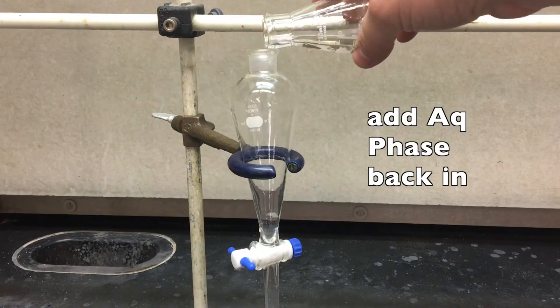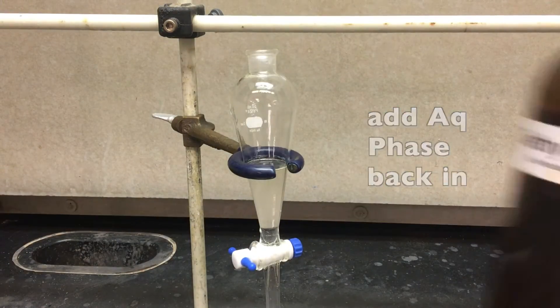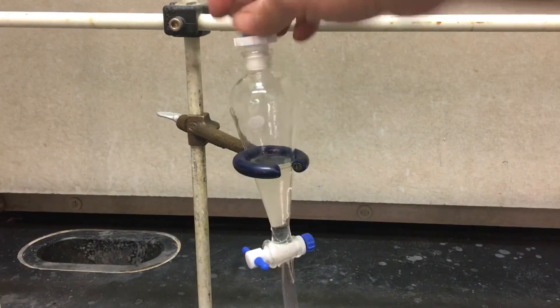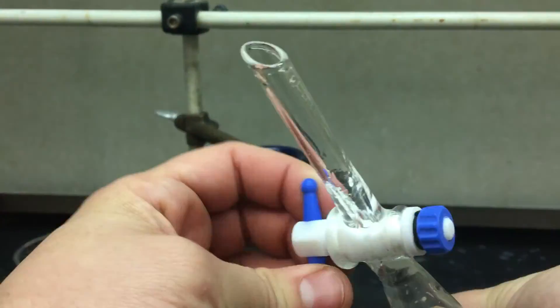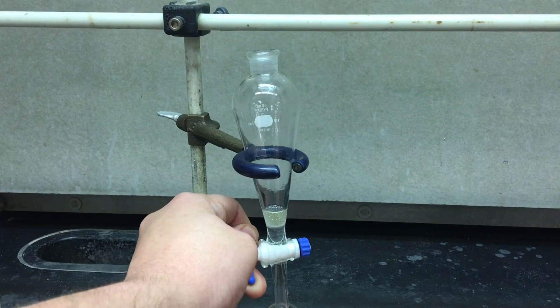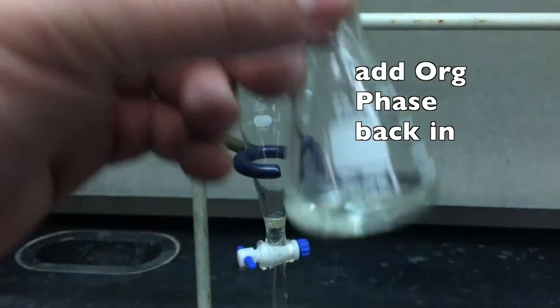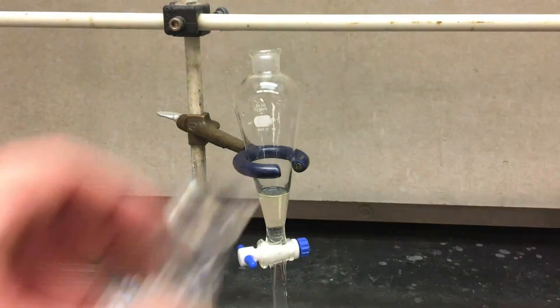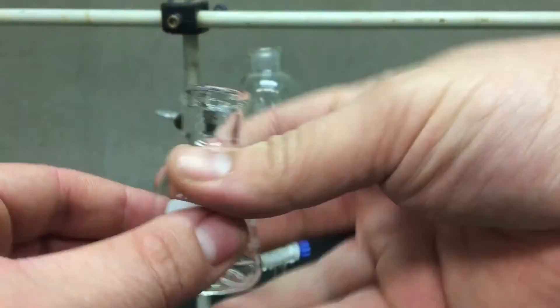Place the aqueous phase back in the separatory funnel and re-extract it with a bit more diethyl ether. Notice how I use the ether to clean out the aqueous phase container. Once again, cap, shake, exhaust, repeat, let it settle. Collect the aqueous phase again — we're done with that, that is trash. To the organic phase you have left in the separatory funnel, add the organic phase you had from earlier. Rinse the container with more ether. Hopefully you're starting to see a pattern emerging.